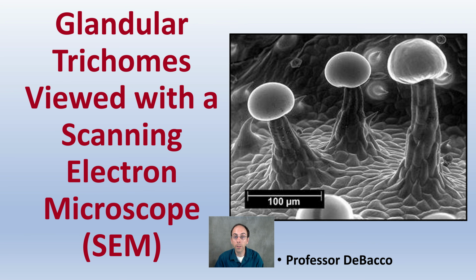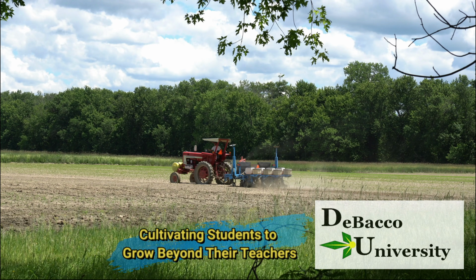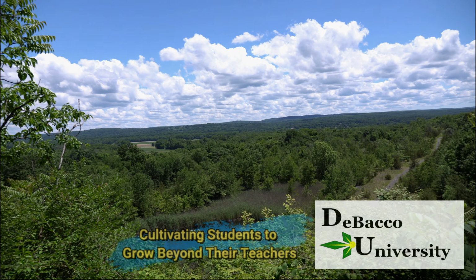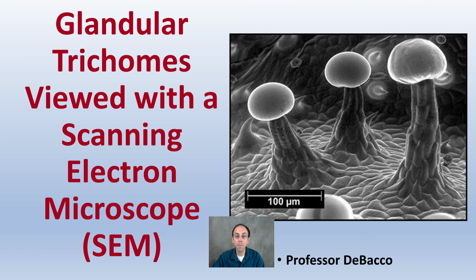This DeBacco University video goes through glandular trichomes viewed with a scanning electron microscope to give you a different perspective and a different look at these structures that you've probably seen quite a bit from a macroscopic standpoint. So this is really going to be a detailed look at these basic structures. So hopefully you tune in.